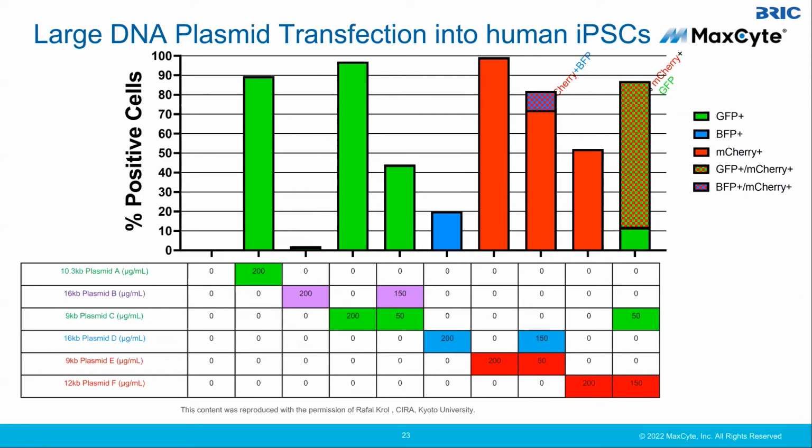But I know there are a lot of researchers who are trying to co-deliver larger DNA plasmids. So I just wanted to demonstrate that it can be done, but it is a little bit more challenging as the plasmid gets larger.